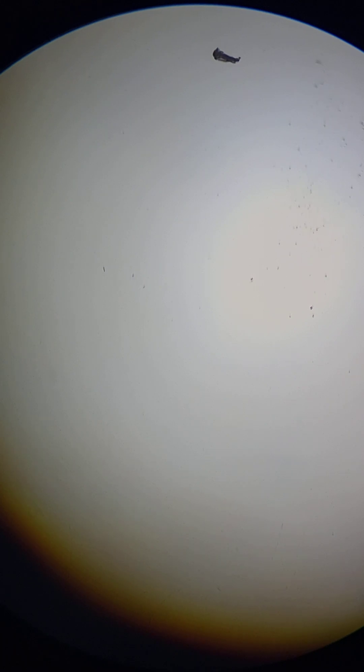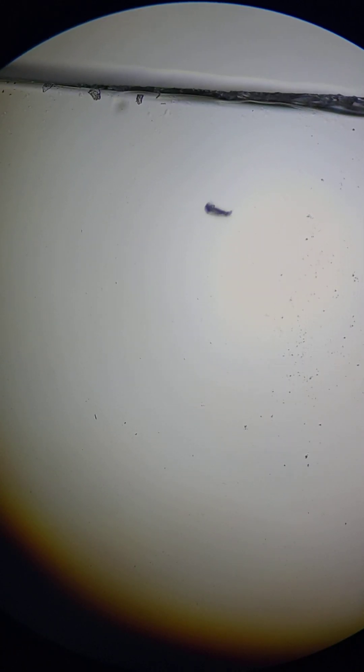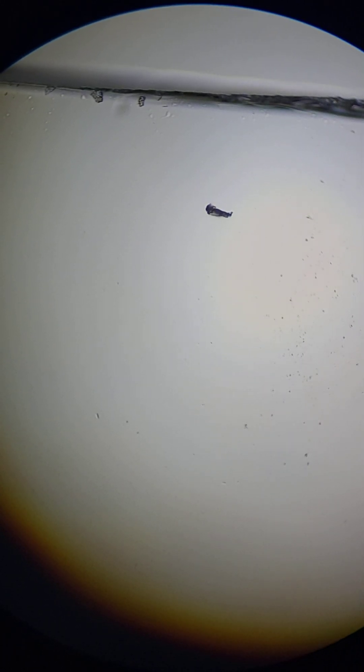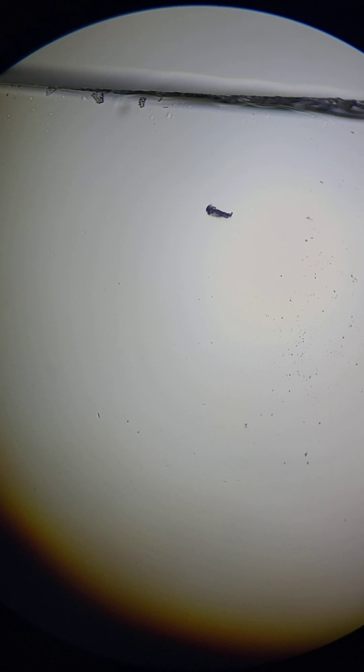Well that shouldn't be there. That would take it to 400 magnification. I am at 150 now. Now I am at 400 magnification and set to that magnification for the whole scanning.